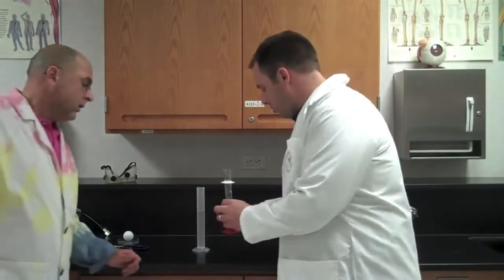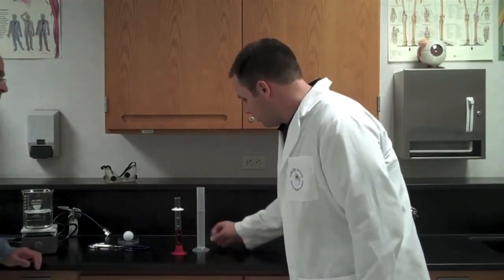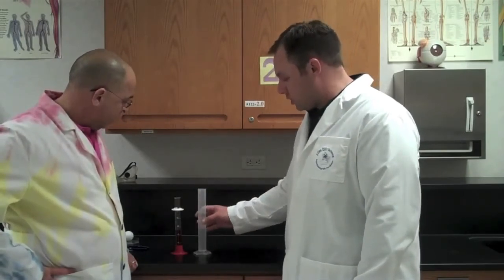This right here is volume, measuring volume. Now you can actually measure volumes in several different ways. You can measure solid volume, you can measure gas volume. Here we have liquids, water being a liquid. So we're measuring liquid volume. We use a graduated cylinder to measure liquid volume. These are both graduated cylinders, they're two different types.